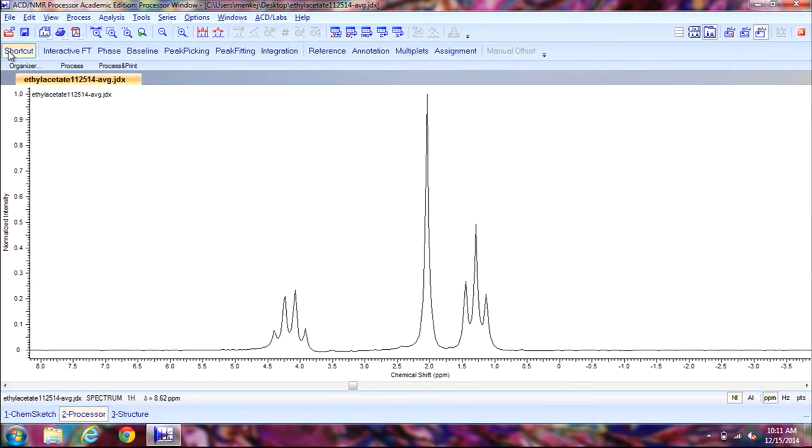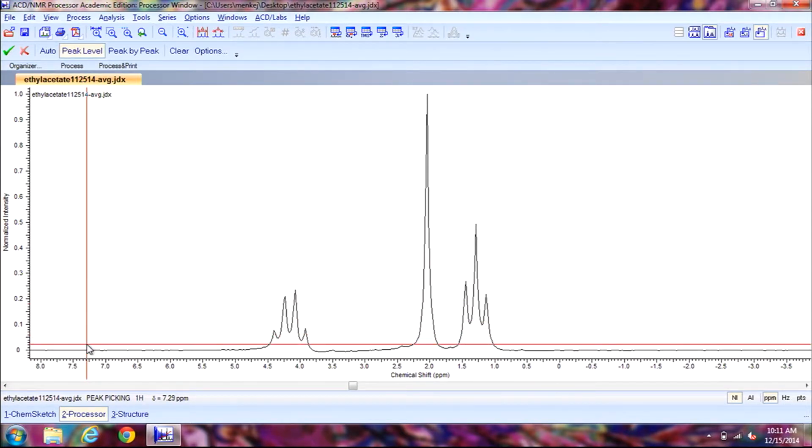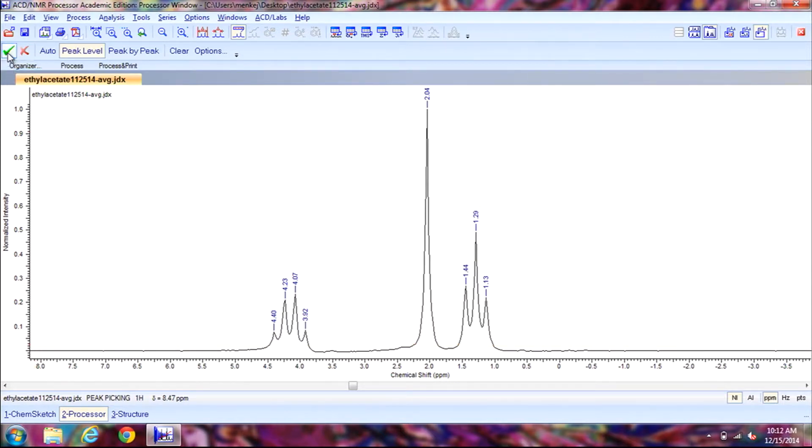Next we will click on peak picking and then click on peak level. This will bring up a red bar. What we want to do is leave all the peaks that we want in our sample to be above the red bar and any impurities left below it. So I'll drag it down to here and then click, and then again click on the green check mark to exit out.